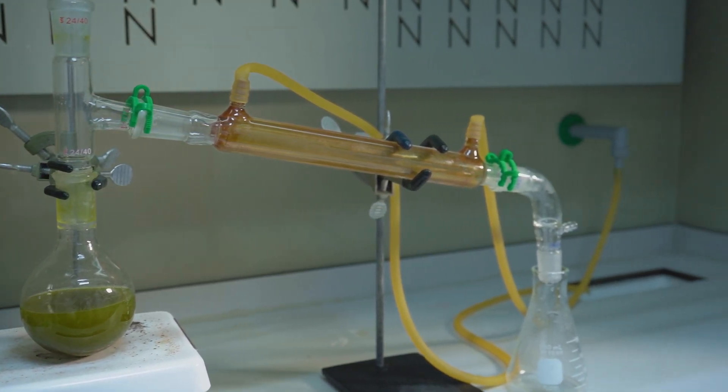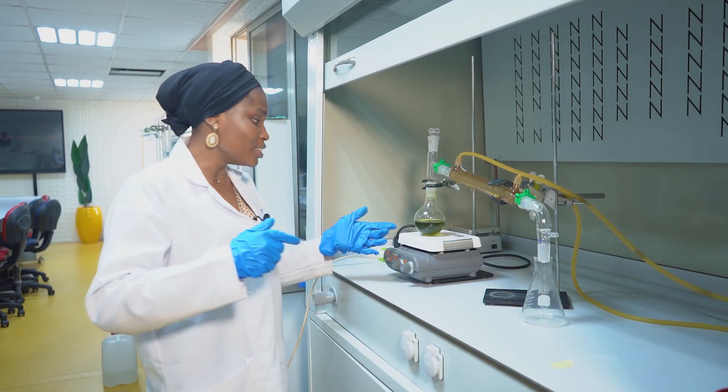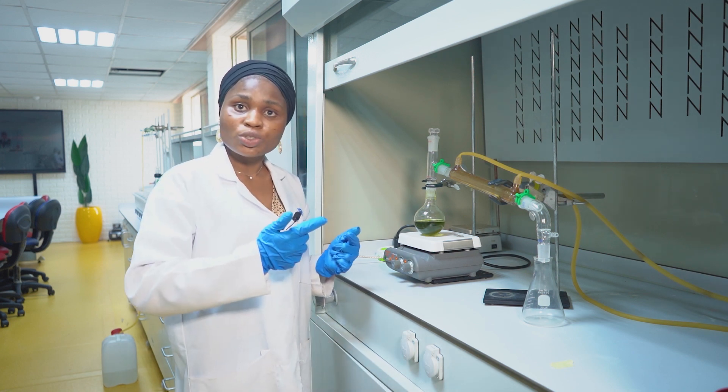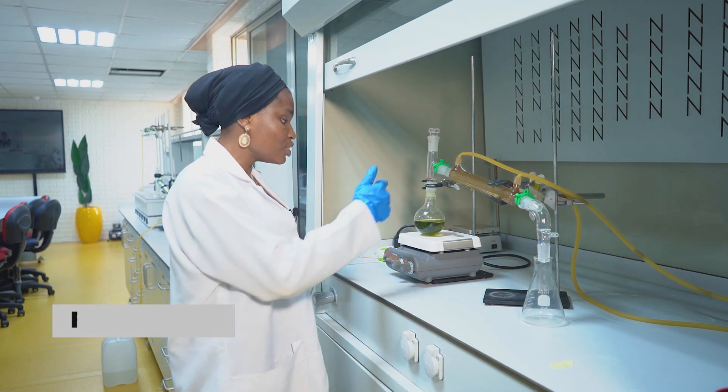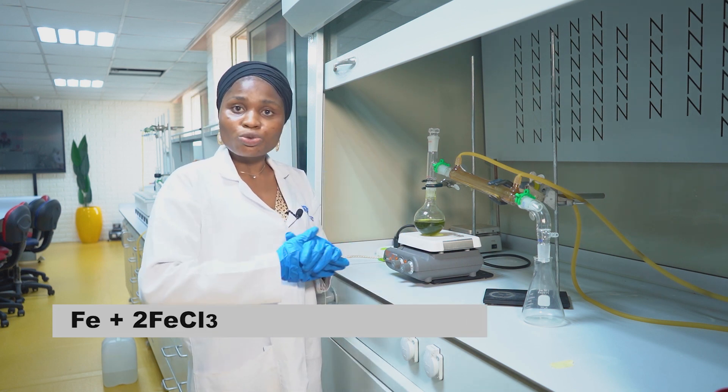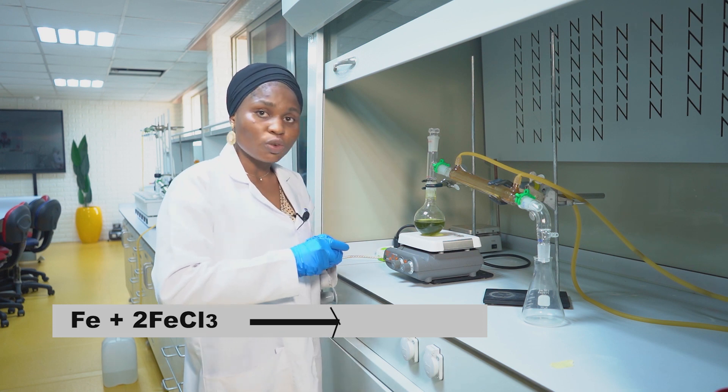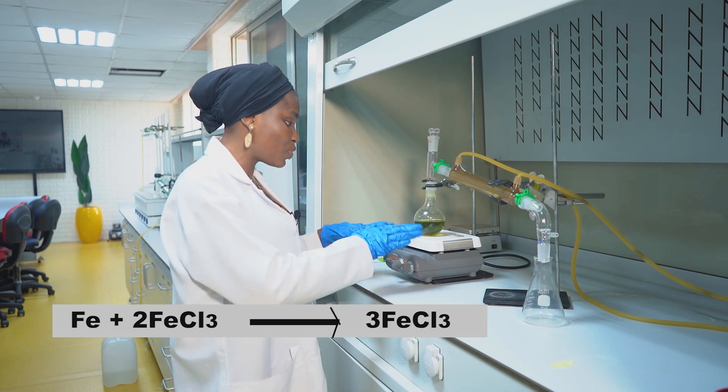So I'll explain what happens, the reason why I added the nails. Instead of getting ferric chloride, which is iron-3 chloride, the nails will undergo redox reaction to give us the iron-2 chloride, which is your ferrous chloride, and that's the final thing we need.